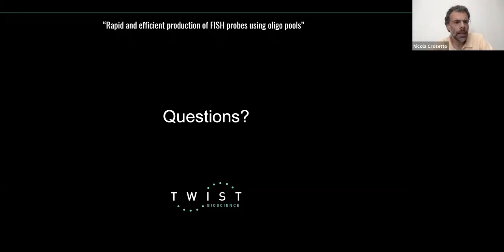Maybe Eleni knows a little bit more than me because she works in the lab more than me. But I think we have pretty much gone down to 48 oligos with DNA FISH. I'm not sure if we tried an even smaller region. Eleni, do you remember if you tried a smaller number of oligos?